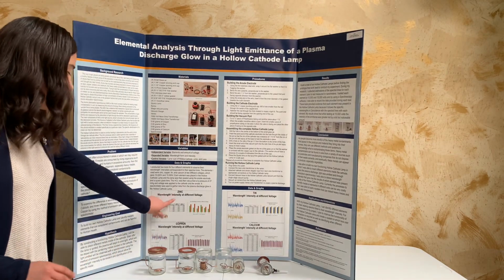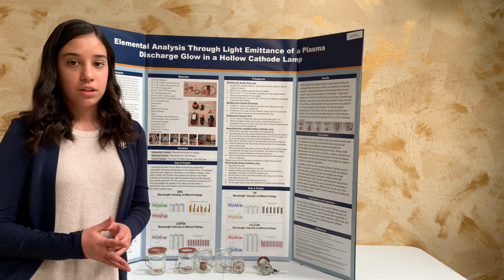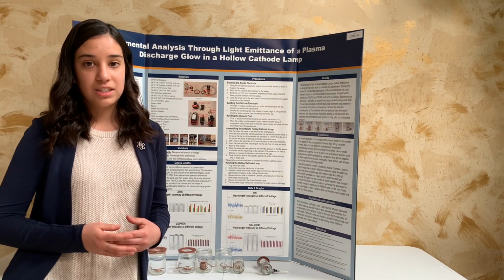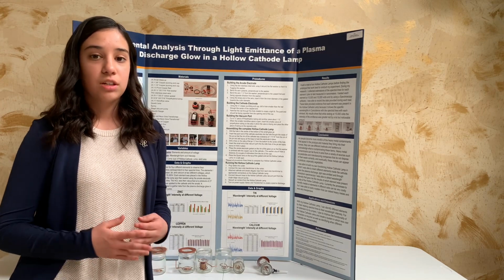So here I have my zinc, copper, tin, and calcium. Now, at the 10,000 volts, the correlation between the wavelength intensity and the spectral lines were evident. And at 15,000 volts, I found an even greater correlation between the two.